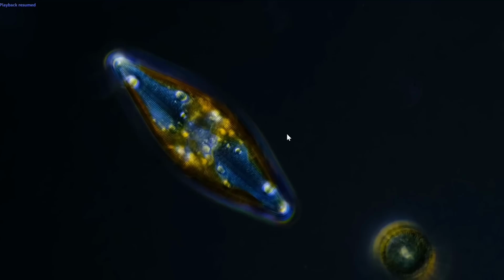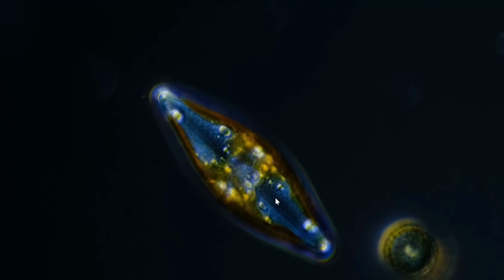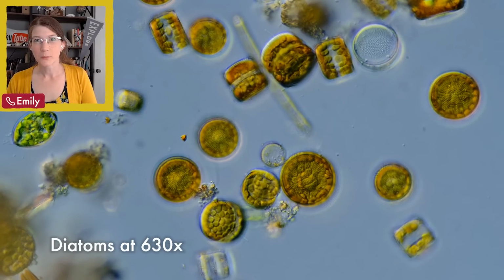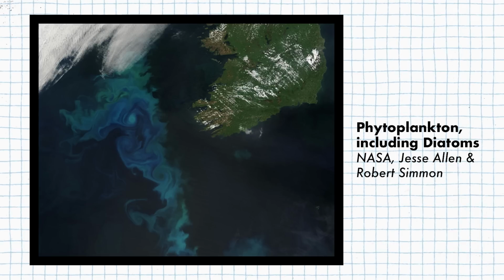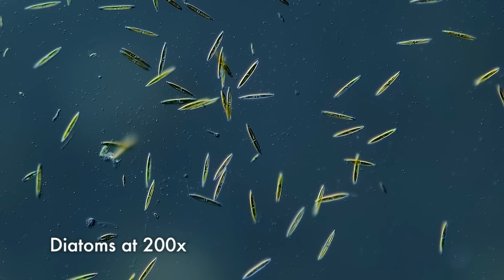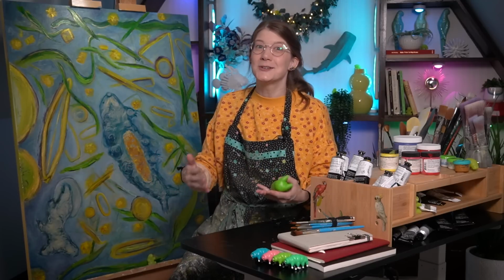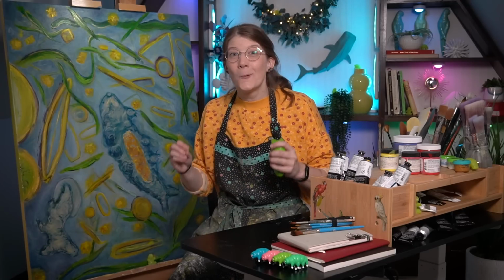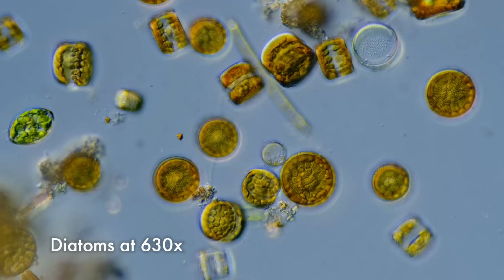Like this diatom. They're quite famous. There are like trillions of them on Earth, and they generate more oxygen than the rainforest every year. What? Yes. Two-thirds of the oxygen on Earth comes from diatoms. There's just so many of them, hundreds of thousands of different species, and they're found in most every aquatic environment in the world. They fossilize really well, and they're valuable indicators of ecosystem health, so they create great records of our planet's changes over time. Their cell walls are made of silicate, which is glass. It protects them while they're alive and preserves them when they die.